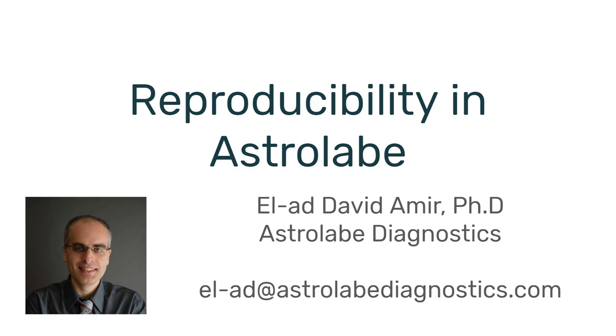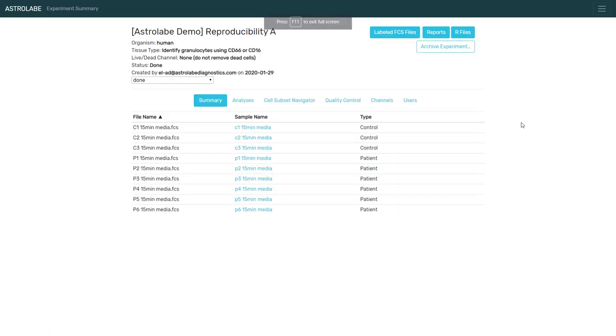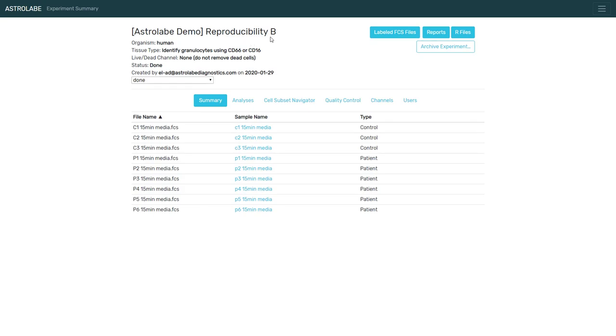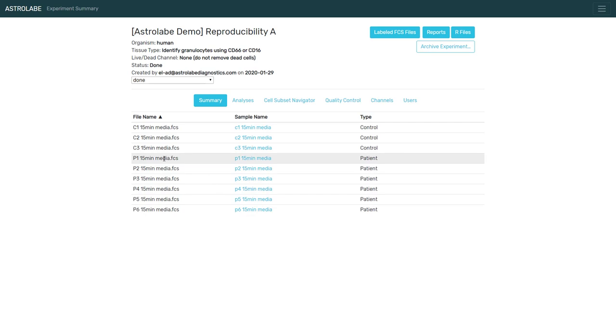So what about Astrolabe? I've taken the same data, and I have run it three times. We're going to call these experiments reproducibility A, B, and C. And each of these experiments has nine samples, three control samples and six patient samples.